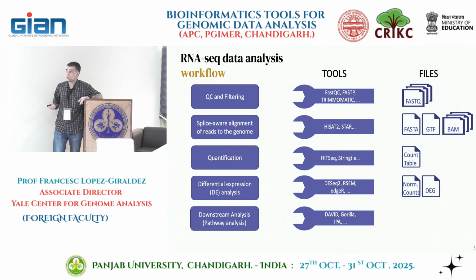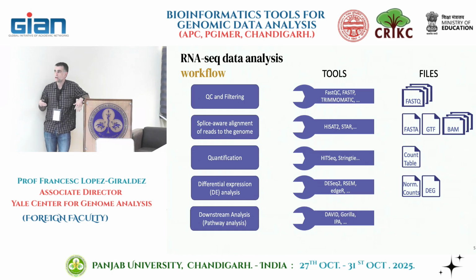With this, if you want, you can do all other analysis, right? The most common one would be a pathway analysis, and there are amazingly a number of tools available, and even websites where you can just upload your data and do the analysis. Some of them are DAVID, GOrilla, Ingenuity Pathway Analysis, which is a commercial one, and so on. There are plenty of them.